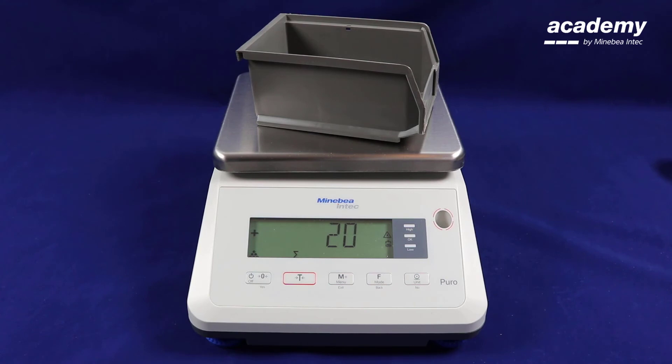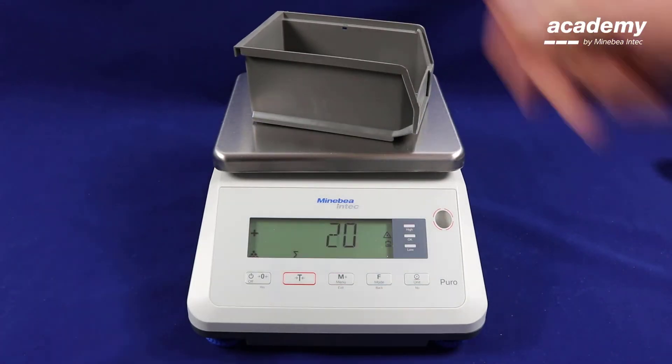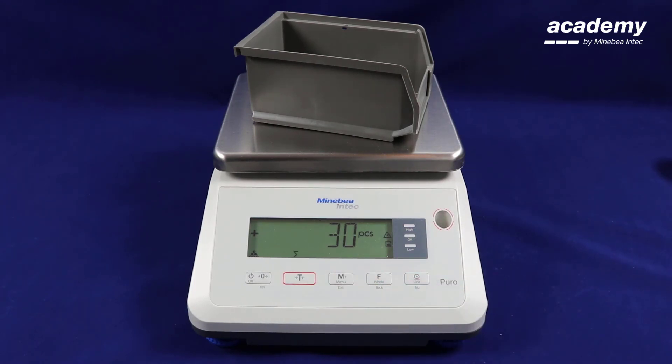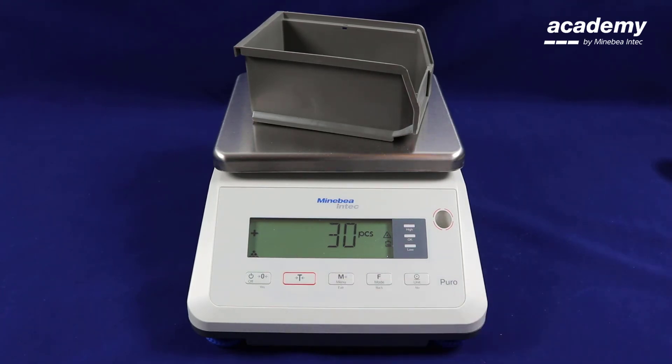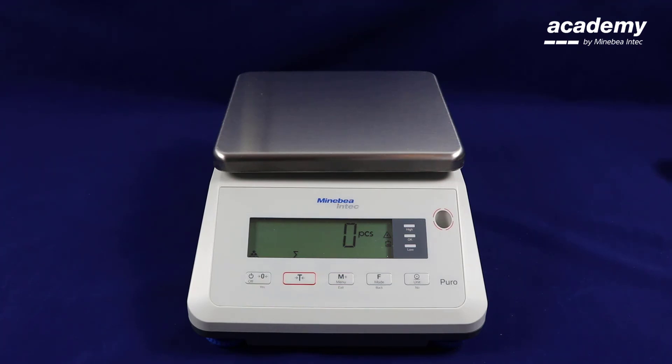Continue this process as often as required. When you have completed your weighings, press and hold the M plus key to retrieve your statistics. This will give you the total number of weighings, the total piece count, the minimum number of pieces, and the maximum number of pieces weighed.